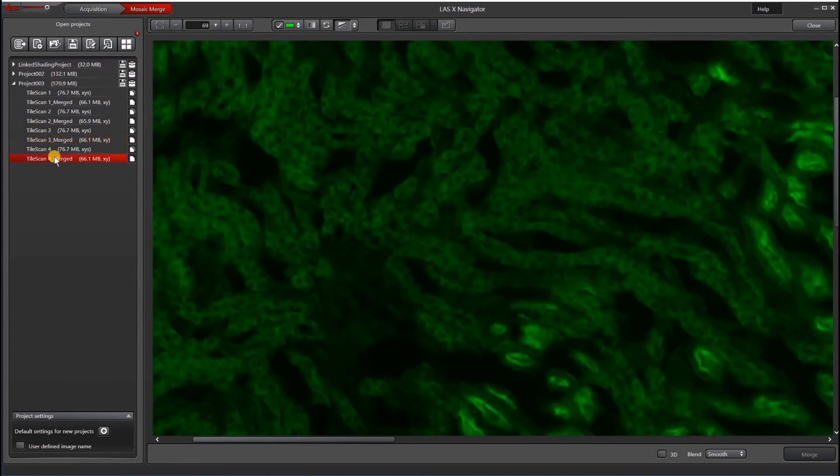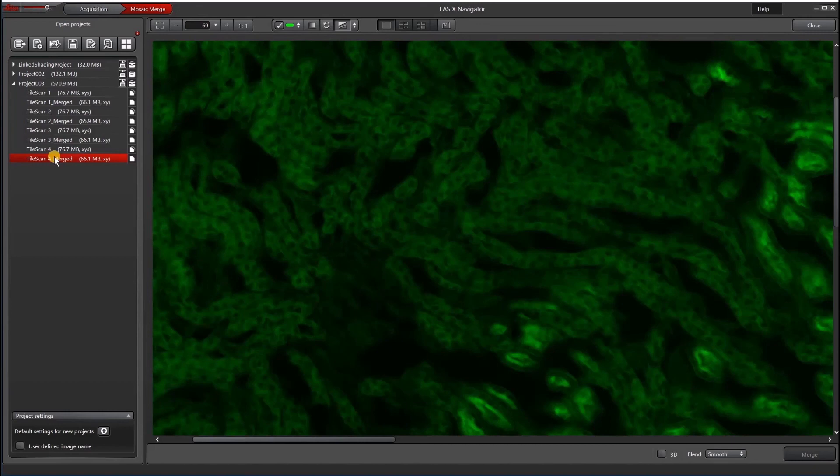If you're having issues getting an in-focus image with AFC, make sure that your objective is compatible, and that your sample is clean and flat, and that the AFC position is holding green the whole time you're imaging. It always helps to have high-quality imaging chambers.